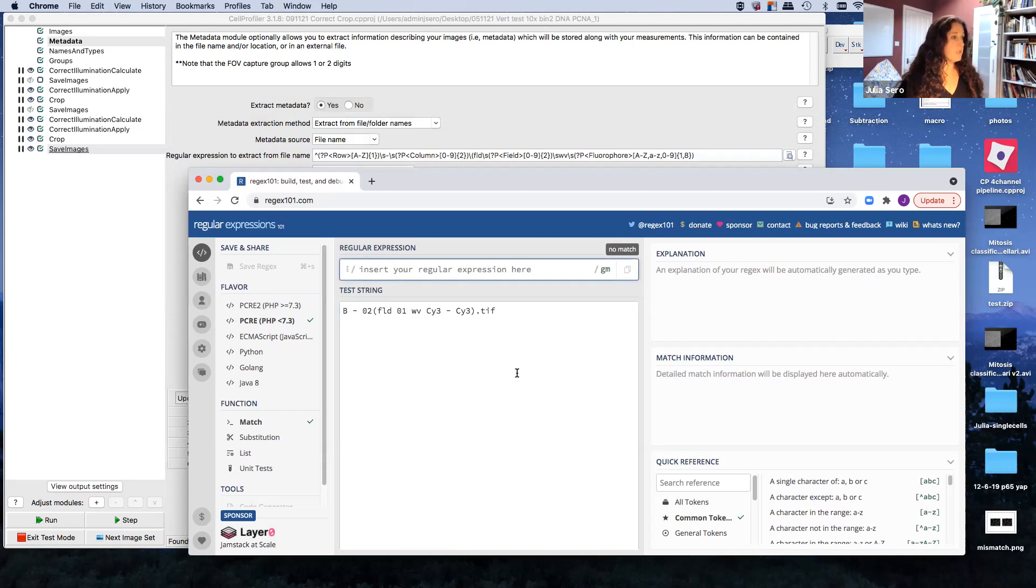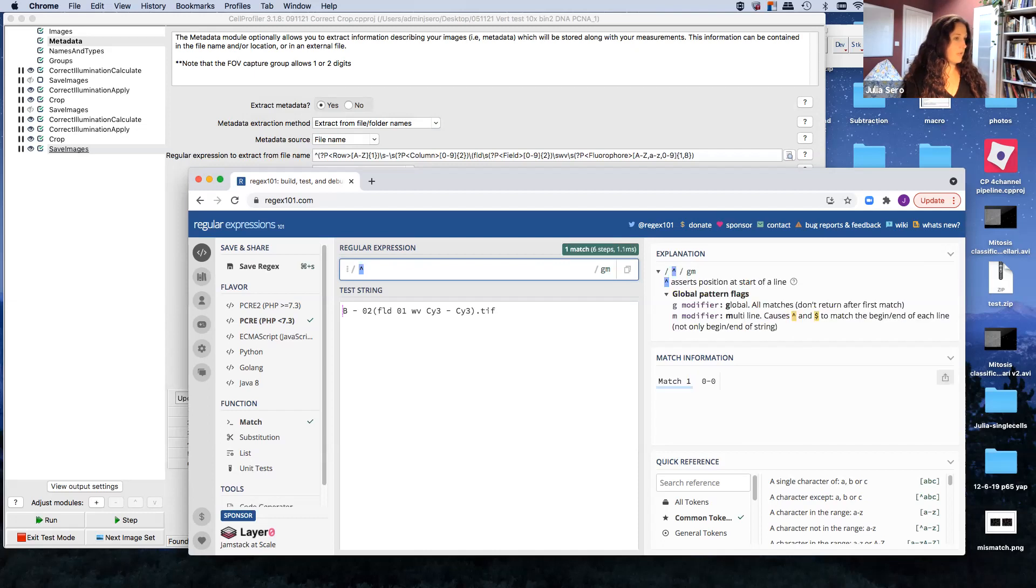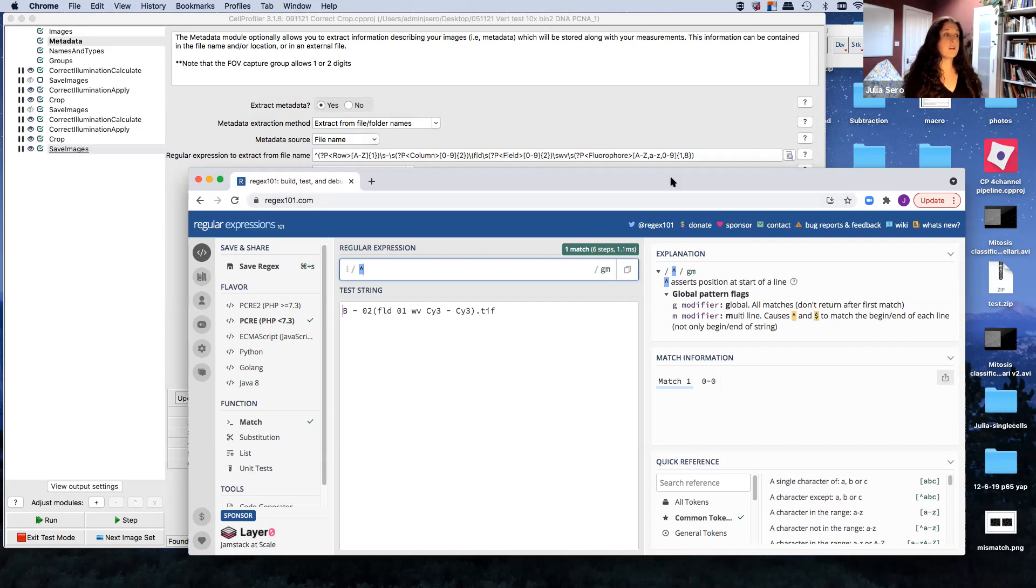I'm going to just talk you through the major players that we need to be aware of here. The first thing we need to do is tell regex that we're going to start doing something. And we do that with a little caret. So it says, search the position of the start of a line. This is where we start. So look at the file name, we're going to start here.